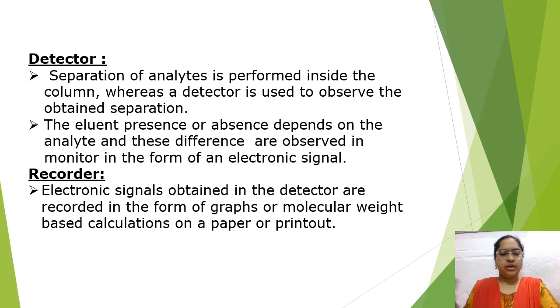Next, recorder. Electronic signals obtained in the detector are recorded in the form of graphs or molecular weight based calculations on a paper or printout. So the above detected signals are sent to a computer and recorded in the form of graph or molecular weight based calculations.